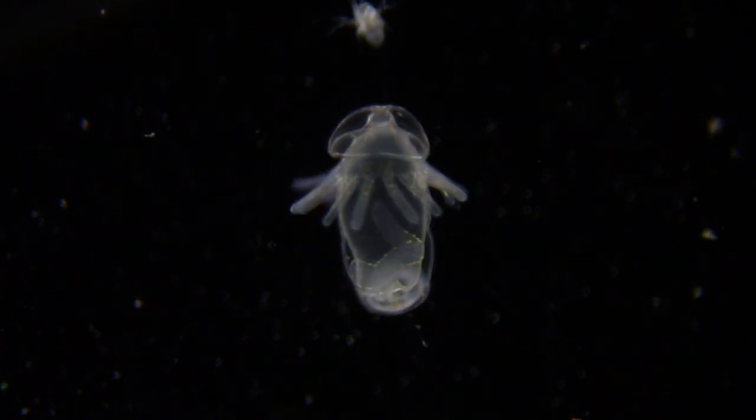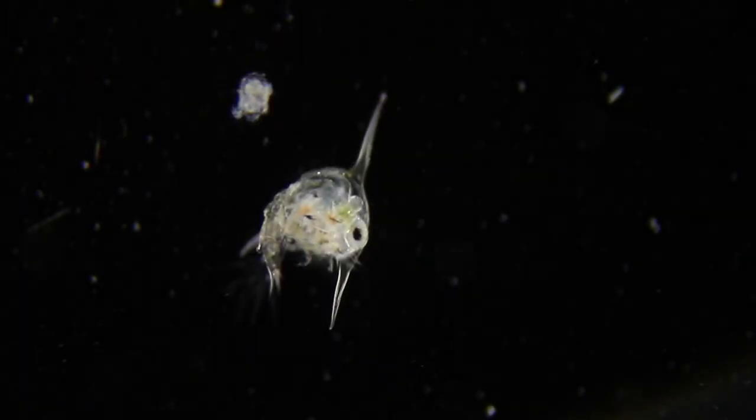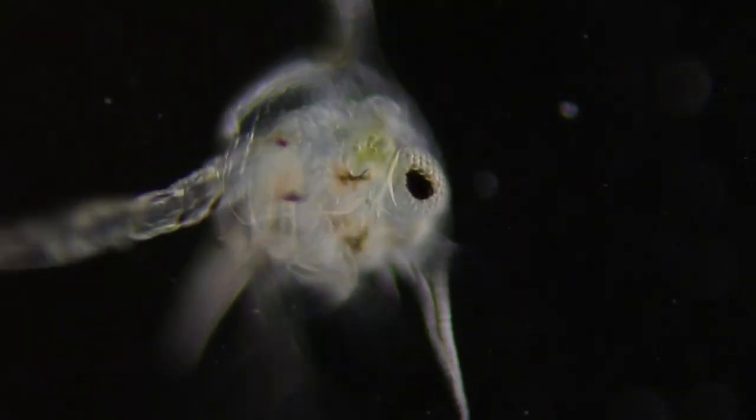Much of the zooplankton are larval organisms, like this young crab zoea. It has large, characteristic spikes on its shell.